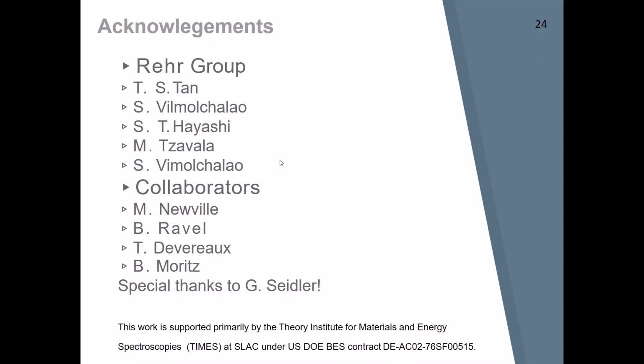Yeah, so I think in general, the idea will be that you will be able to do a reasonable calculation from the start. Not necessarily that you wouldn't want to go and do a convergence test or change your pseudopotentials, but we should have a bank of pseudopotentials that are reasonable.